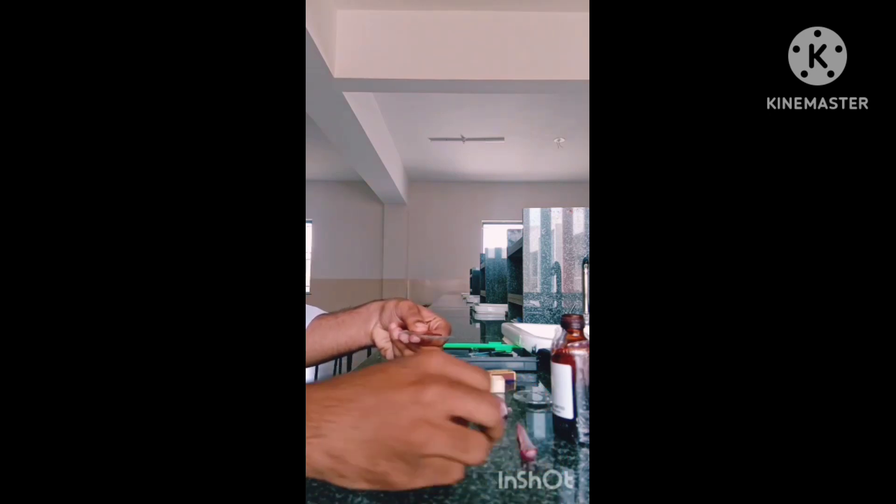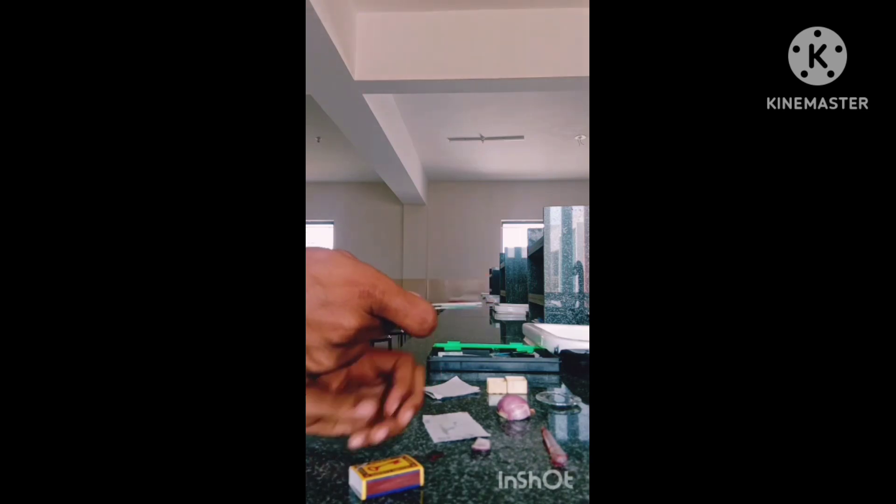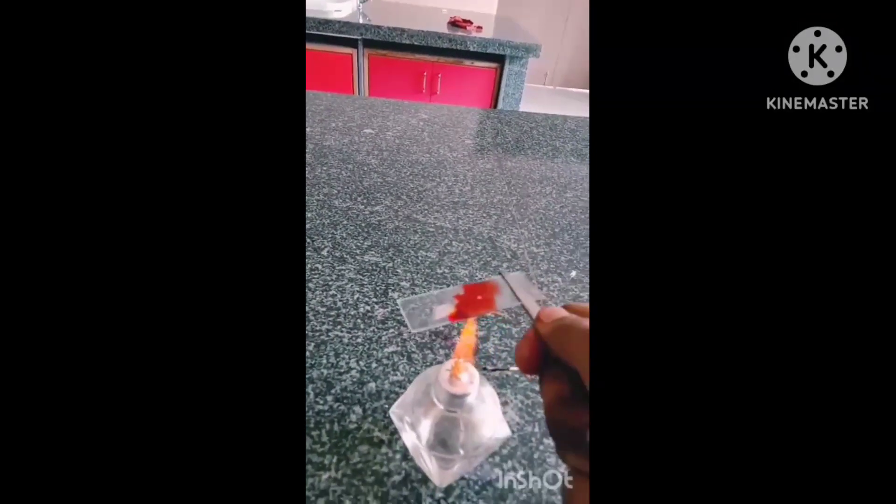Add 2-3 drops of acetocaramine stain on the peel.